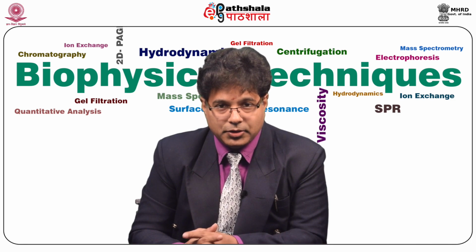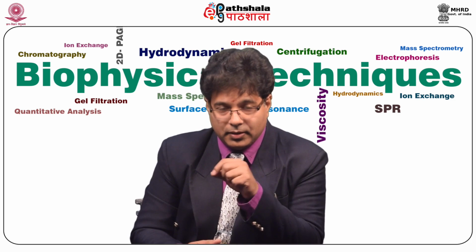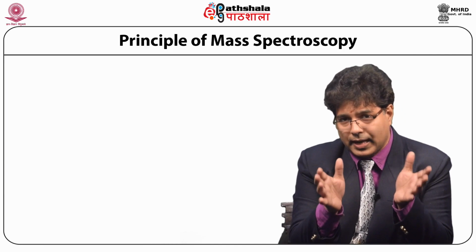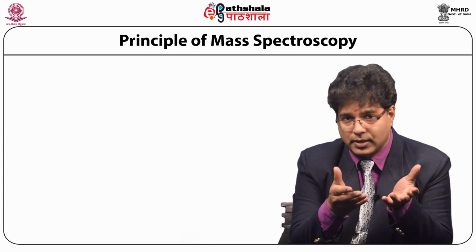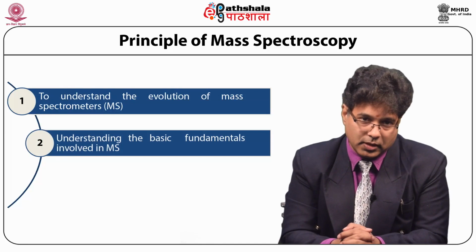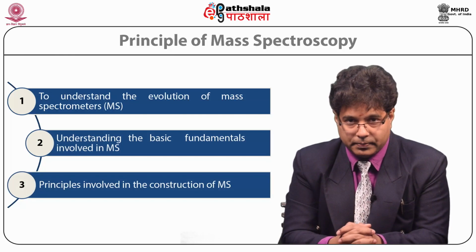I am here today to talk about the principles of mass spectroscopy from the paper Techniques in Molecular Physics 1. Let us first understand the basic fundamental aspects of mass spectroscopy. Therefore, I objectivize this lecture to understand the evolution of mass spectrometers, the basic fundamentals involved in mass spectroscopy, and the principles involved in the construction of mass spectroscopy.